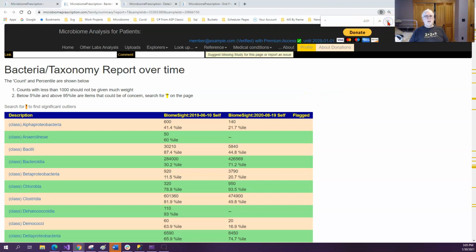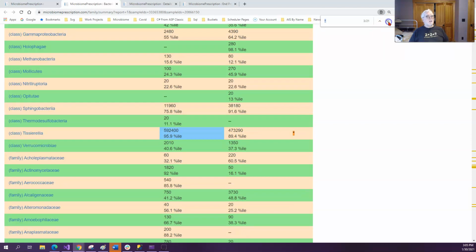Imagine that. So we now just go through. There's the first one. We were very high. We went down a little bit, but the numbers are still high. And actually, that's very high because in terms of bacteria, it's out of a million, and you have half of them being just one particular class of bacteria.